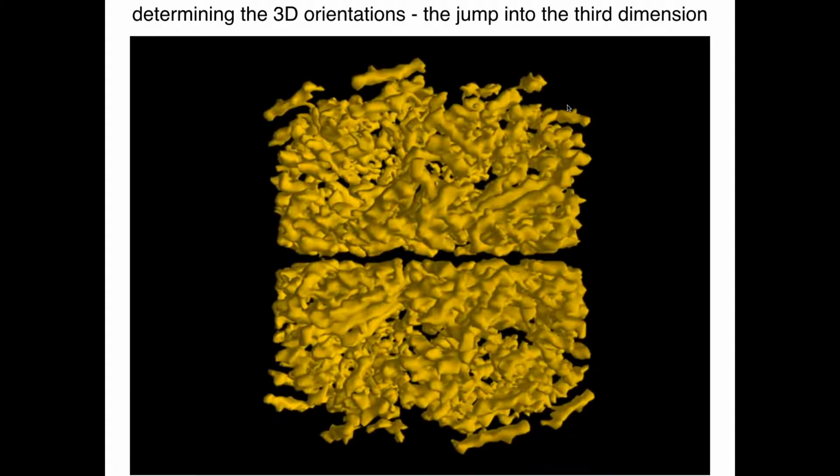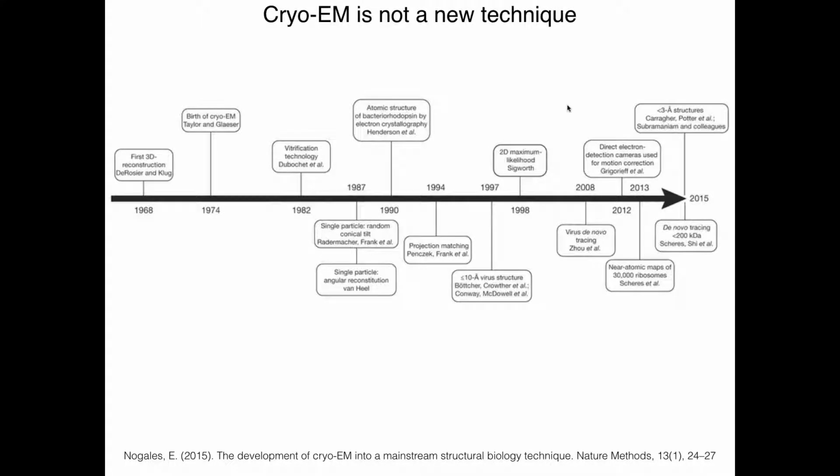Okay, so you're downweighting the noise, and you're increasing the amount of signal. You're downweighting the noise in the 3-dimensional reconstruction. This is an actual experimental reconstruction of Cryo-EM. It is now low resolution by today's standards. It was high resolution a number of years ago, but it's 5 angstroms. It's quite low resolution by today's standards.